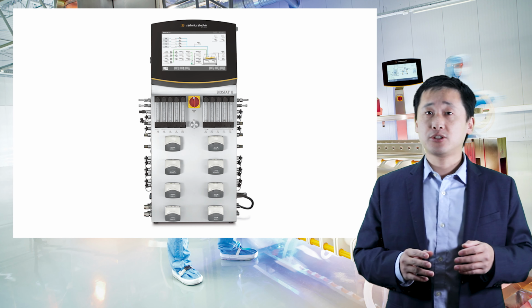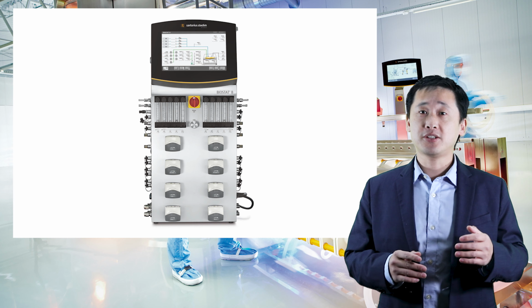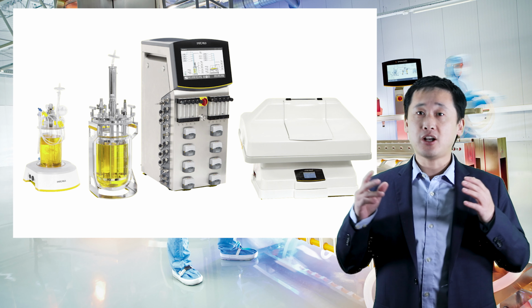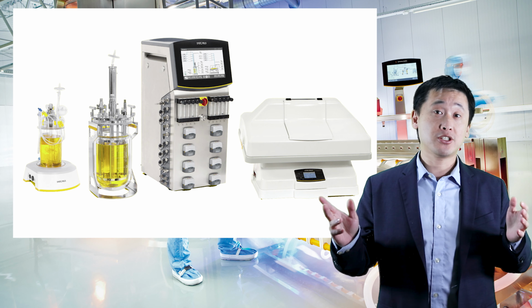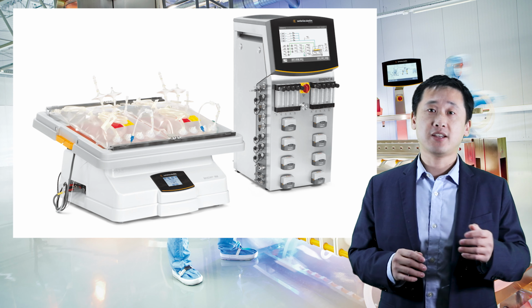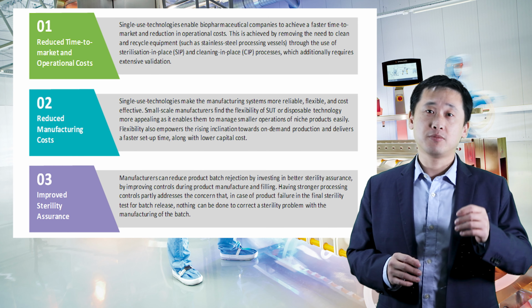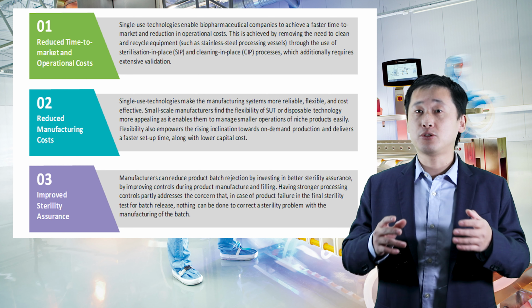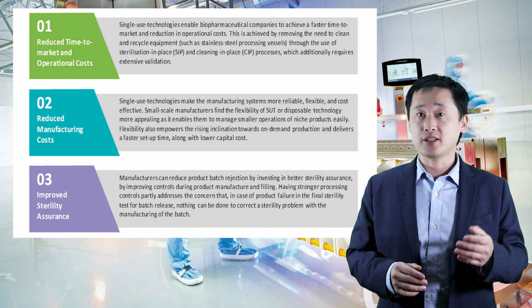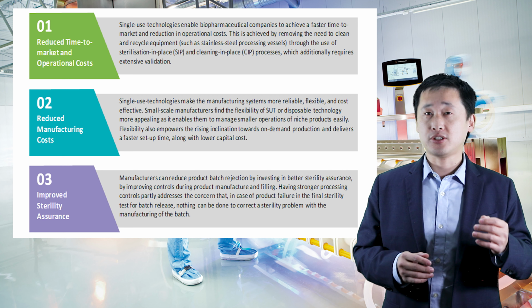Now, for the setup, the Sartorius Biostat B universal benchtop controller will make automating cell expansion at this volume straightforward. Now, this controller is capable of working with various other bioreactor configurations, but for today, we're going to be looking at the Wave Mix Rocker with FlexSafe RM bags. Now, the FlexSafe RM bags are ideal for volumes from 1 liter to 200 liters with a max working volume of 0.5 to 100 liters respectively. Ideally, the single-use flex bag makes cell expansion easier and more cost efficient.